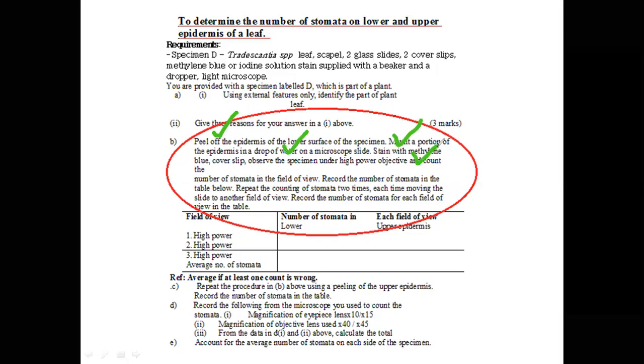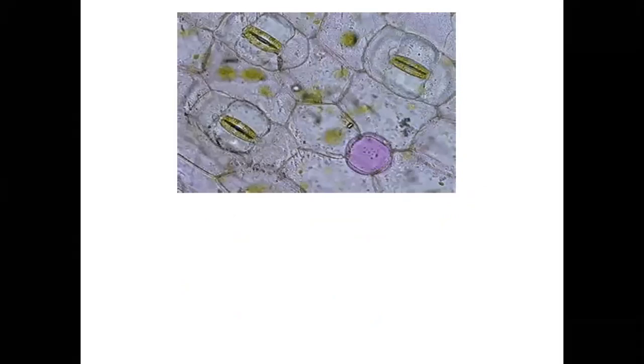So I want to use this now as our platform to go down to the microscopy, the techniques that we need to know when handling a specimen and then mounting it on a microscope. Of course, for instance, and this is a very common part of a leaf that everybody should know, even how it appears.